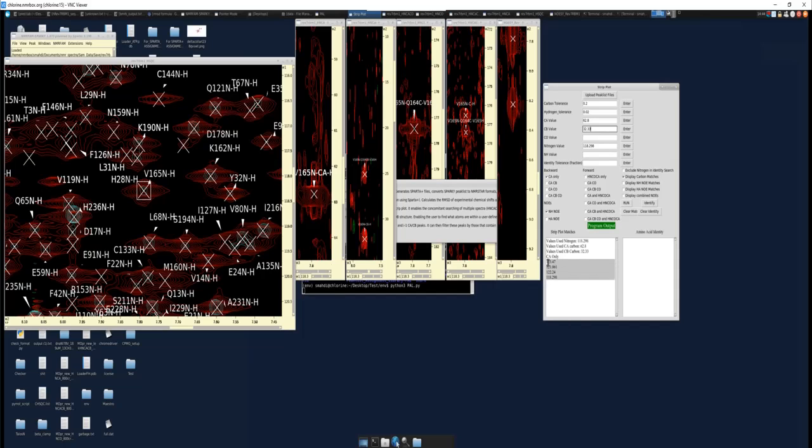So running just the C alpha, you get 4 potential matches. Let's see if we get any from C alpha. Here we go, running the NOE filter. So looking at your NOESY matches as well, you went from 4 to 3. So you're able to eliminate 1. Let's run a C alpha C beta. So running just the C alpha gives you 4. Running the C alpha C beta gives you the same 4.